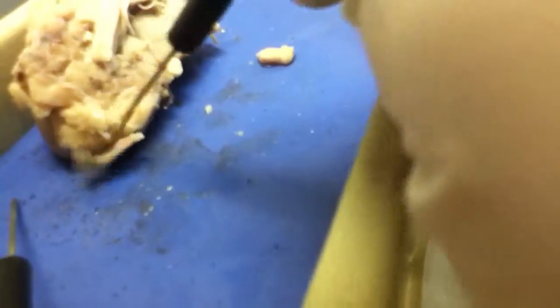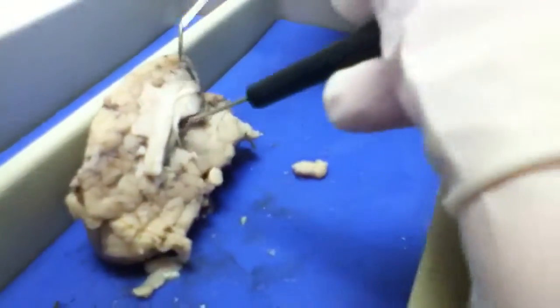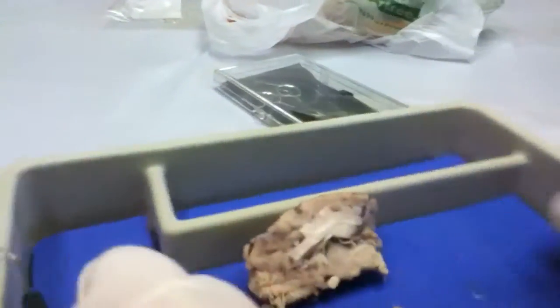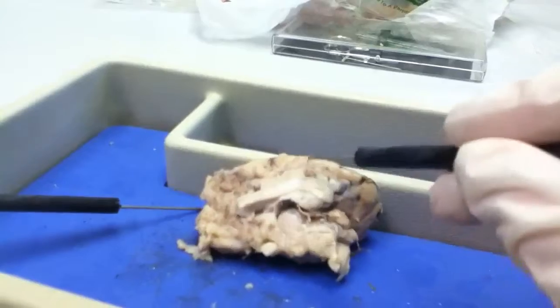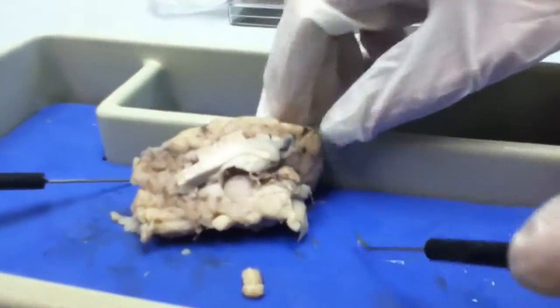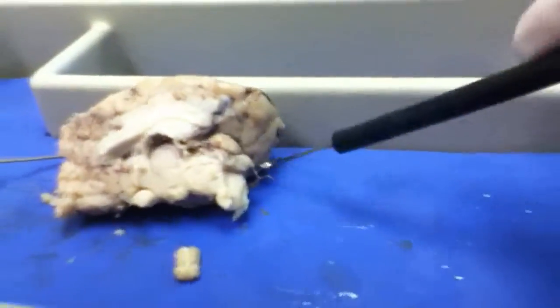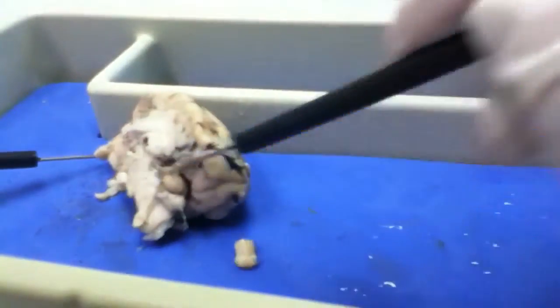It looks like a vein. Put it in the middle there so everybody can see it on your team. What's this little ball here? Is that the pituitary? Thalamus. Oh, it's a thalamus? This little one right here?